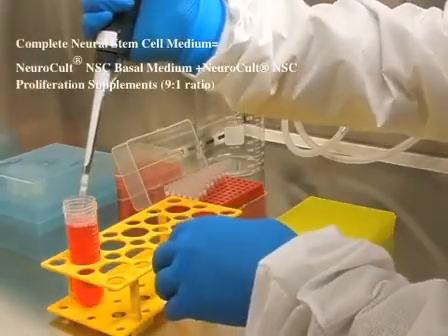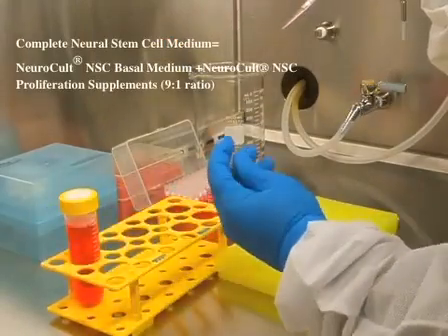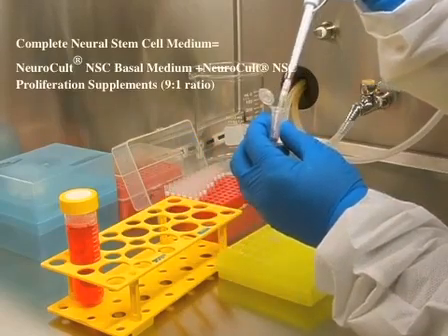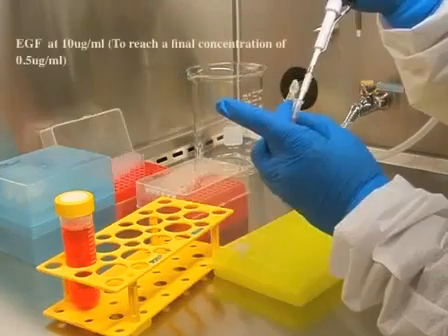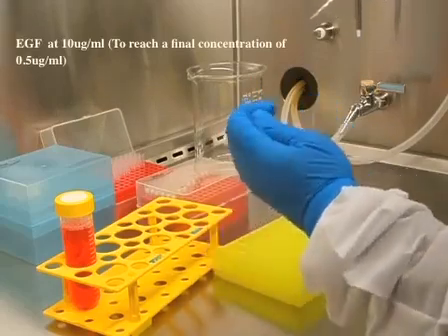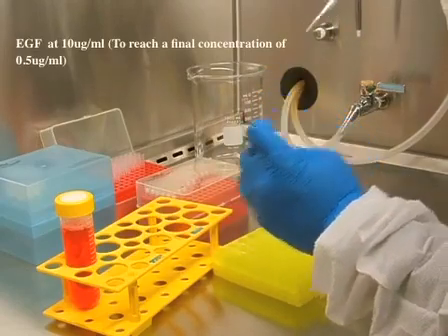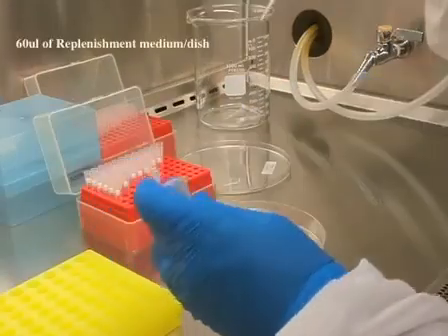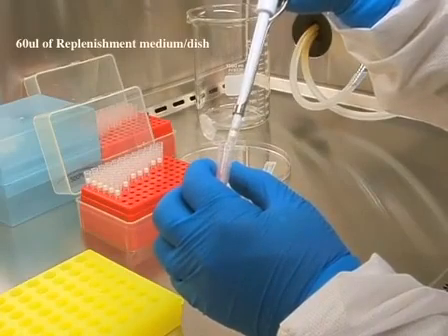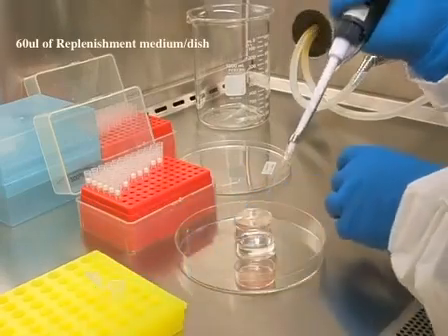To feed the Neural-Colony Forming Cell Assay culture, take 200 microliters of complete neural stem cell medium and add 10 microliters of EGF at a concentration of 10 micrograms per ml. Add 60 microliters of the complete NeuroCult replenishment medium to the center of each dish once every 7 days during the entire incubation period.